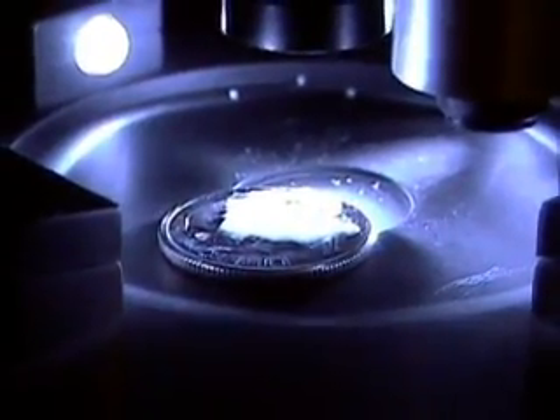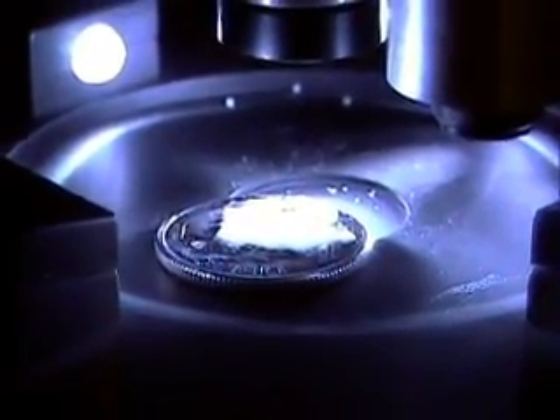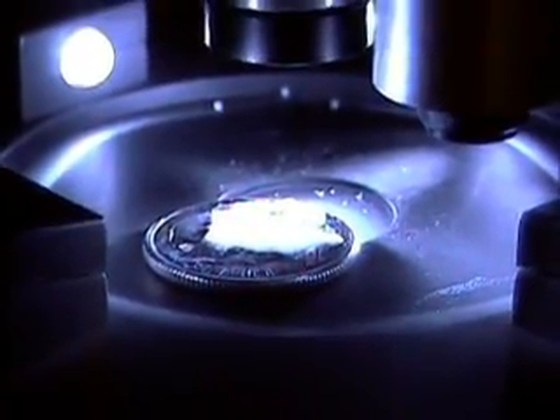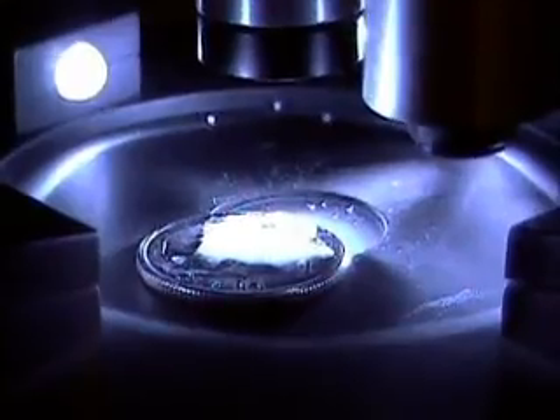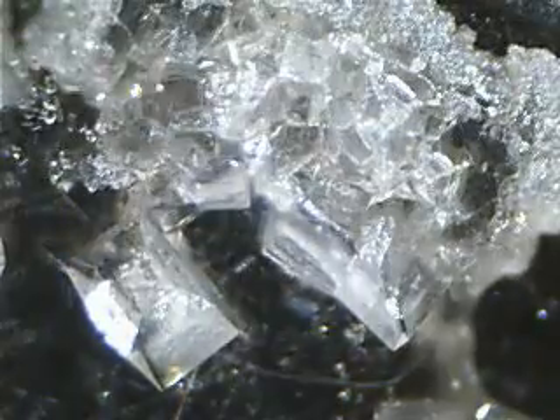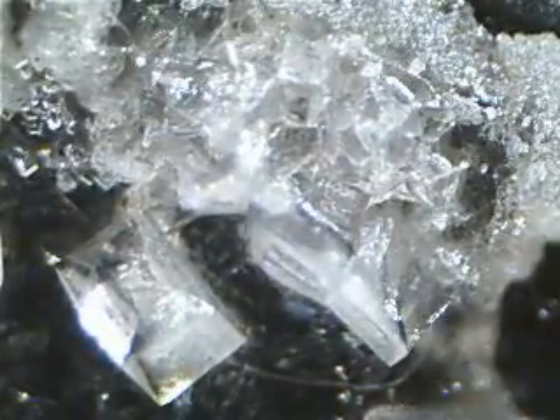Here's my Brando microscope, and what I'm currently filming is a tiny little corner of a dime with some salt and water on it at the highest magnification. The video was recorded at 1 frame per second at 600 magnification. For this demonstration I've increased the frame rate to over 90 frames per second.